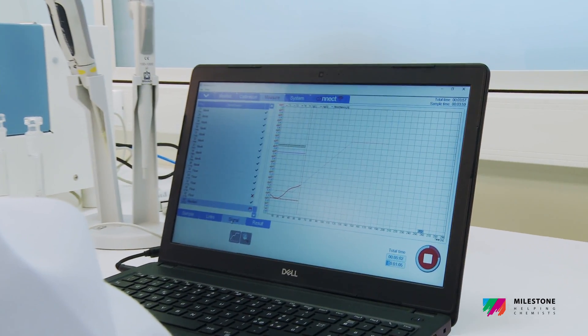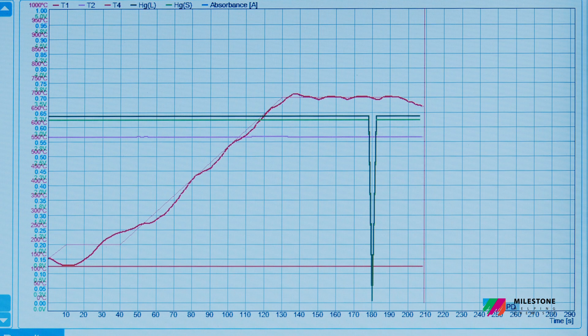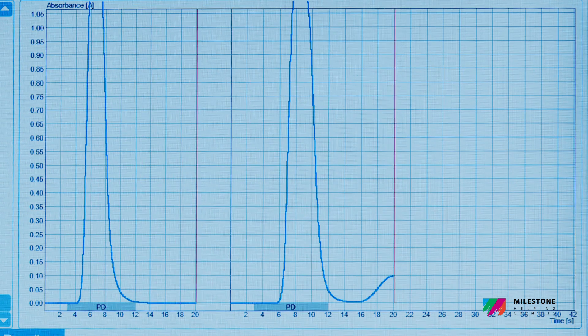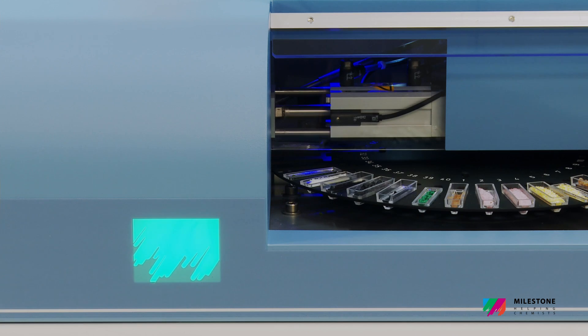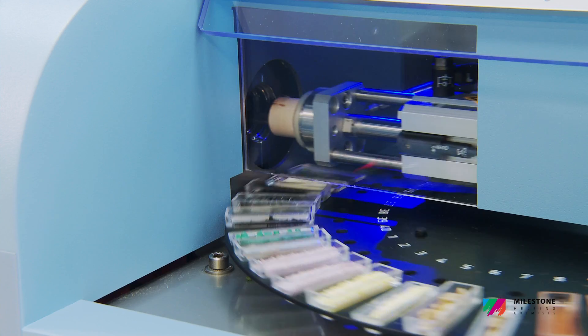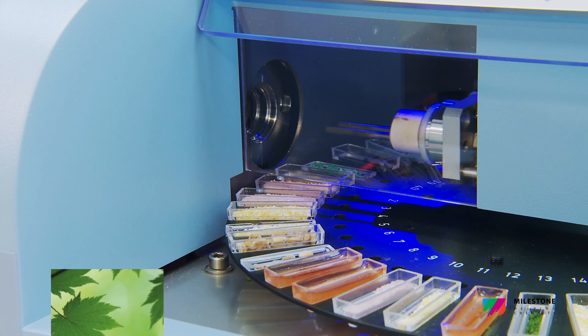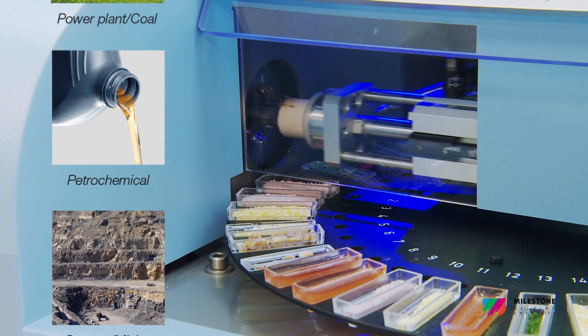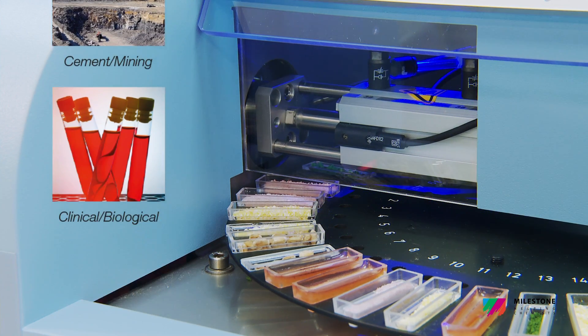The DMA80 EVO runs unattended, offering a unique ease of use, performance, and productivity in mercury analysis. The DMA80 EVO has become the standard in various industries, such as environmental, food, energy, petroleum, cement, mining, and many others.